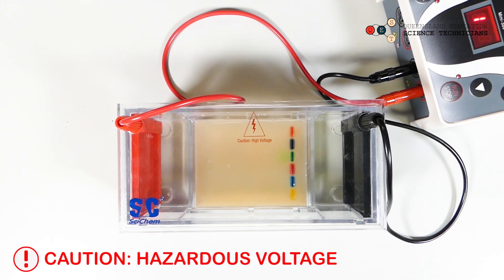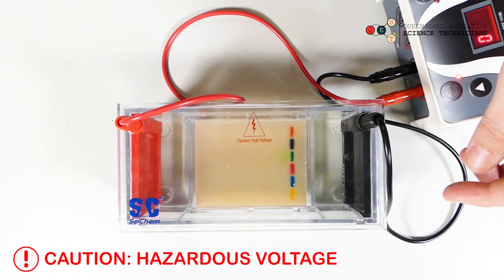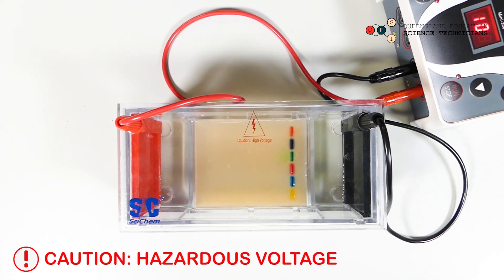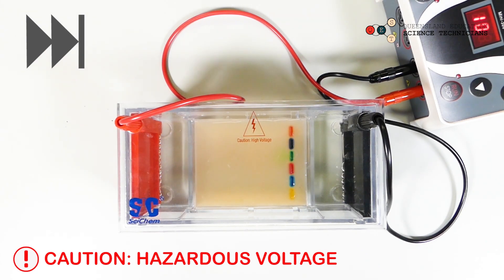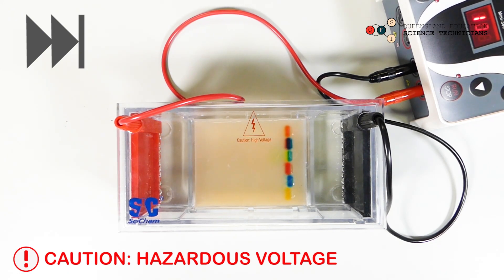Just make sure that the voltage is set to 100, which it is. And we'll press run. You can tell that it's working because you'll start to see bubbles forming at the cathode and also at the anode.